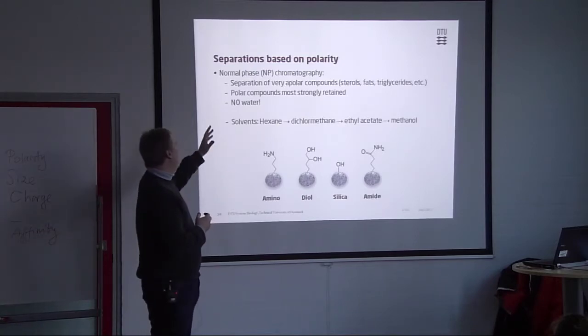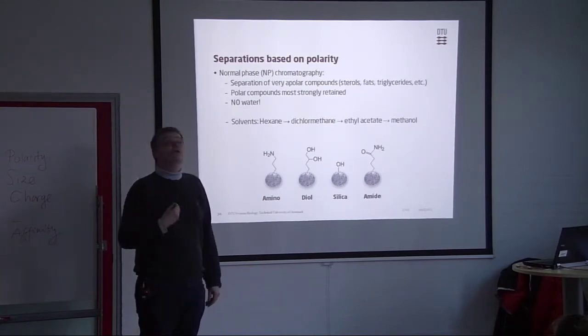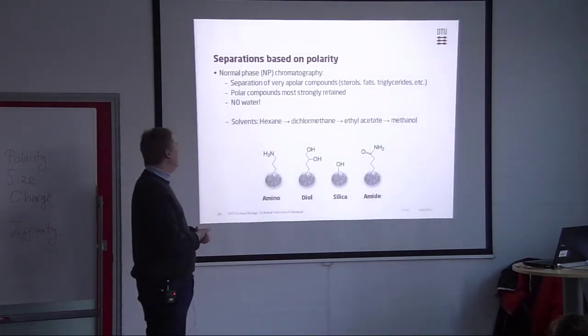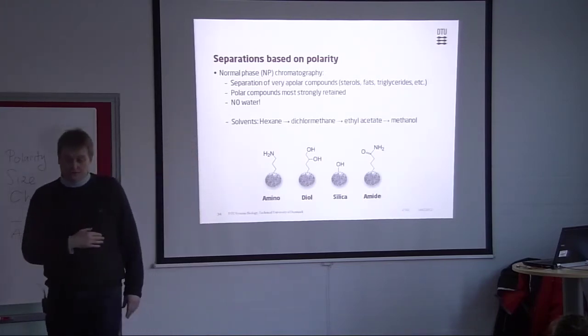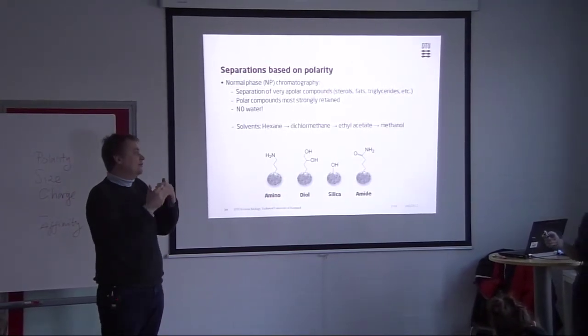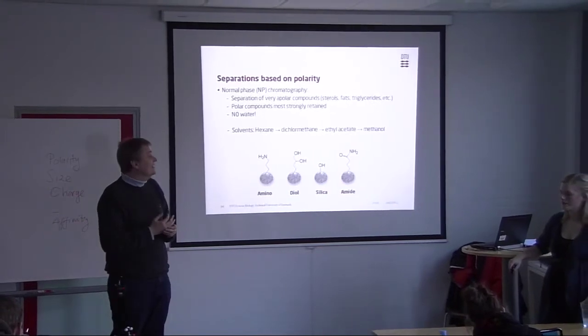Some of those who make these actually add a little bit of water so they know that it's 0.05% water, something like that. Simply put, we cannot control water, so we add a controlled amount. But in general, we try to keep these as water-free as possible. So this is also why this chromatography is not as popular as reverse phase: we have a reproducibility problem because of moisture and all kinds of things.